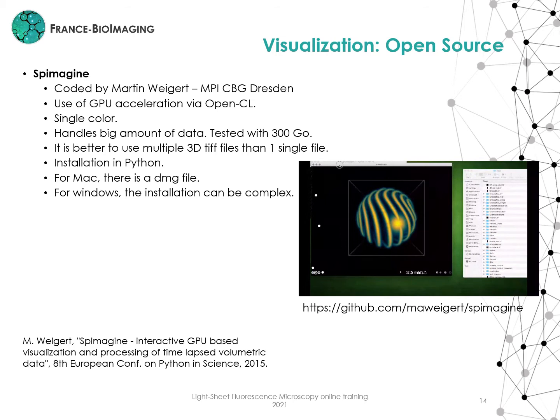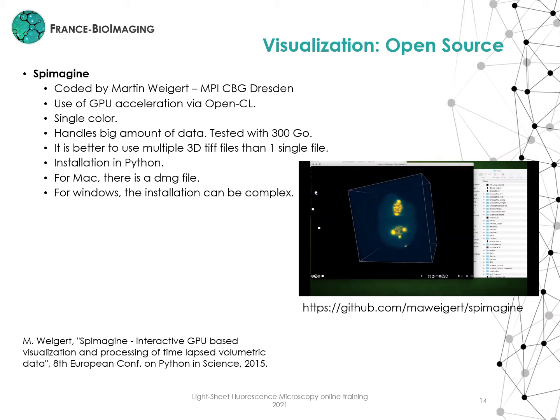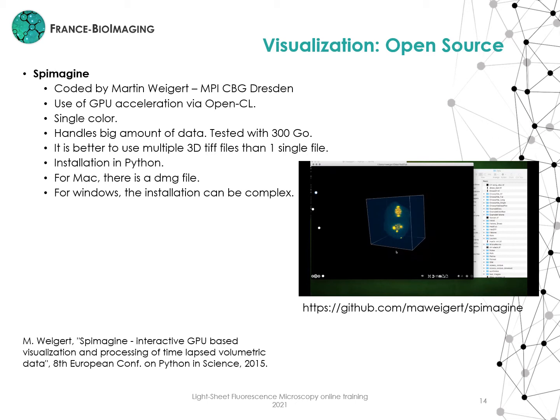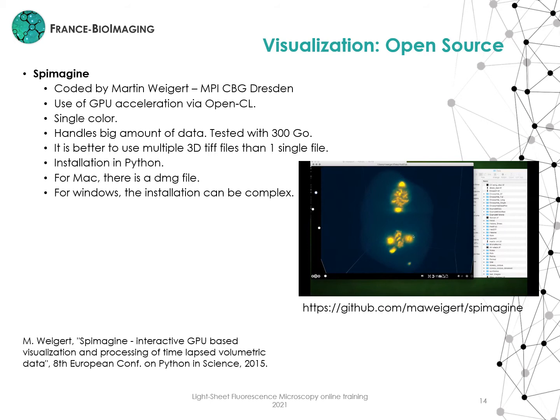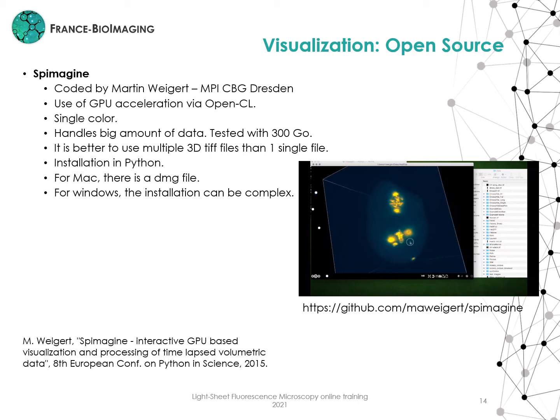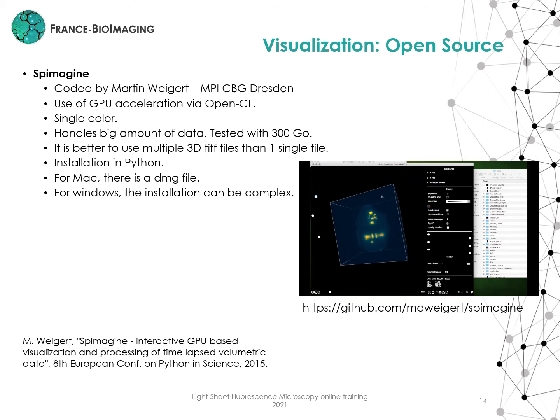Another software is Spimagine. It was coded by Martin Weigert. It uses GPU acceleration via OpenCL. It only allows single-channel visualization. It handles large amounts of data — I tested it with 300 GB. It is better to use multiple 3D TIF files than one single file. It is written in Python, so installation can be complicated. For Mac there is a DMG file, but for Windows the installation can be complex.